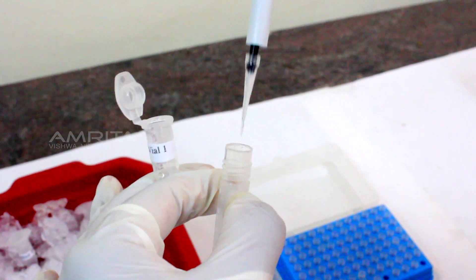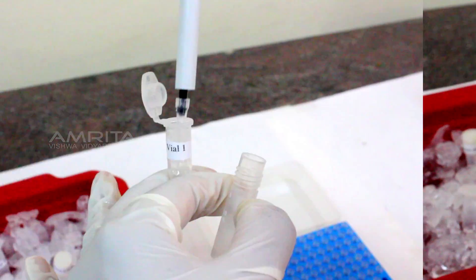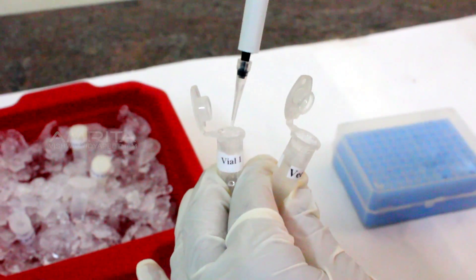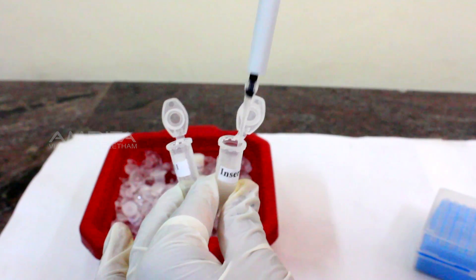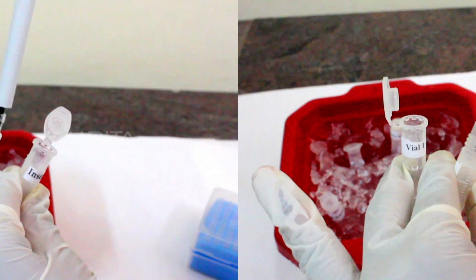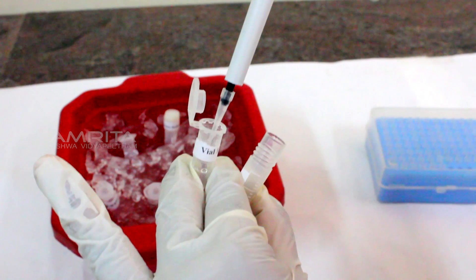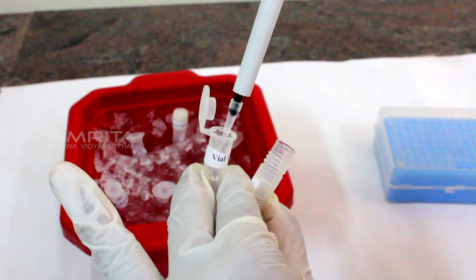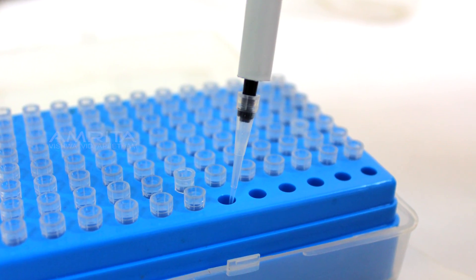Similarly, add 1 microlitre of T4 DNA ligase buffer, 1 microlitre of vector DNA, 2.5 microlitre of insert and 0.5 microlitre of T4 DNA ligase enzyme to the same vial. Make sure to use separate pipette tips for each.